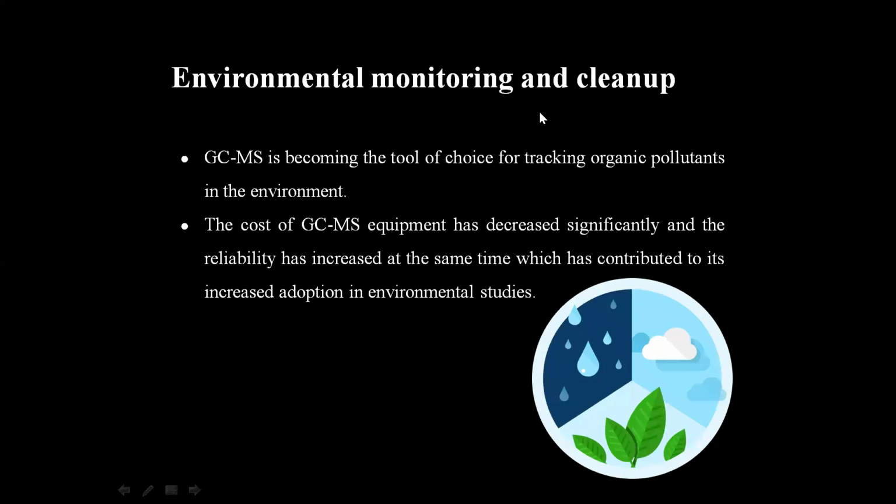Next is environmental monitoring and cleanup. GCMS is becoming the tool of choice for tracking organic pollutants in the environment. The cost of GCMS equipment has decreased significantly and the reliability has increased at the same time, which has contributed to its increased adoption in environmental studies.